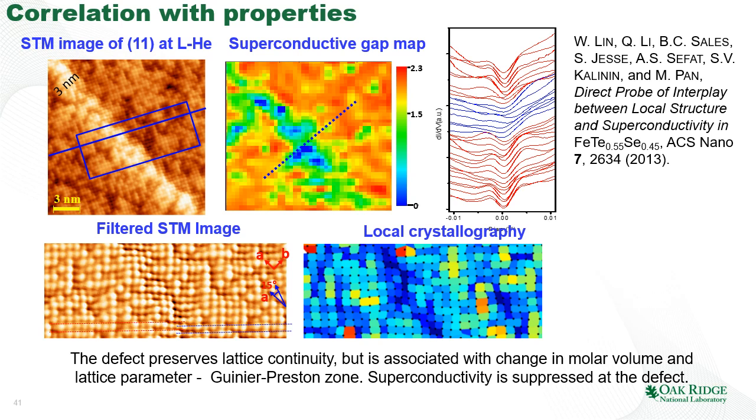So in this case, of course, it is very difficult to do because the structural image and the functional image are not registered. So they are roughly of the same region, but there is no one-to-one relationship between the pixel here and the pixel here.